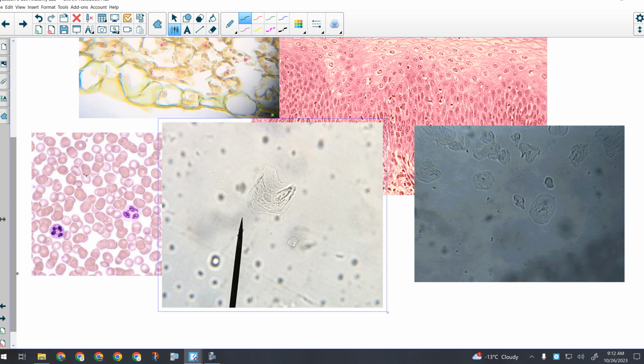It's like a COVID test? Uh-huh. Wow, a COVID test goes up your nose. Yeah. Don't stick this up your nose, okay? Would that have cool cells? No, it would have a lot of mucus.